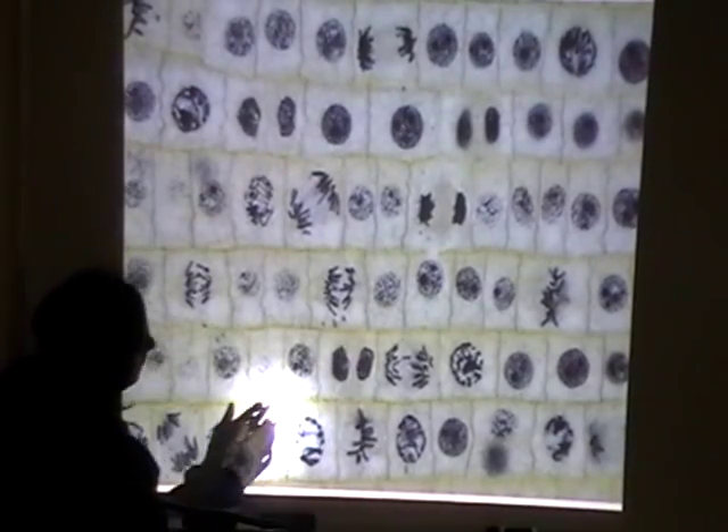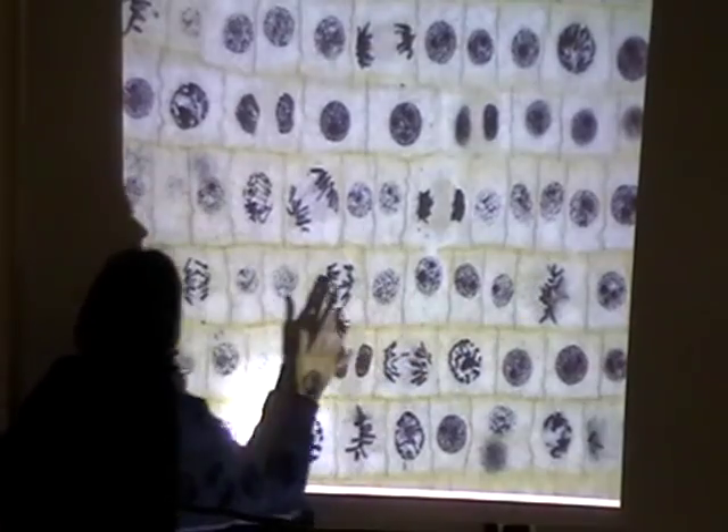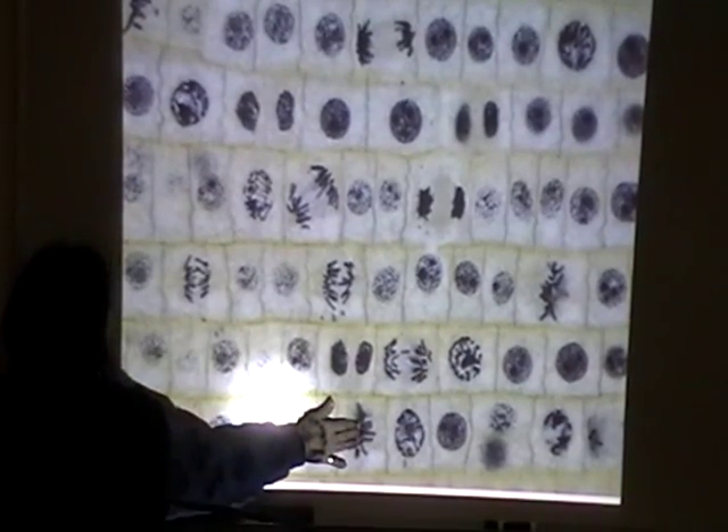And then right over here is our metaphase. We have a metaphase here, and we have a metaphase here, which are very nicely shown.